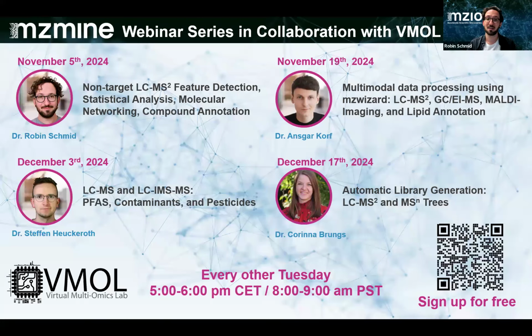And Corinna, also in the panel here, is going to talk about automatic spectral library generation. So if you want to acquire your compounds in your lab, want to share them with other people, or just introduce your own spectral library in-house, we have tools in mzmine to process and generate MS2, MSn libraries, and anything else.